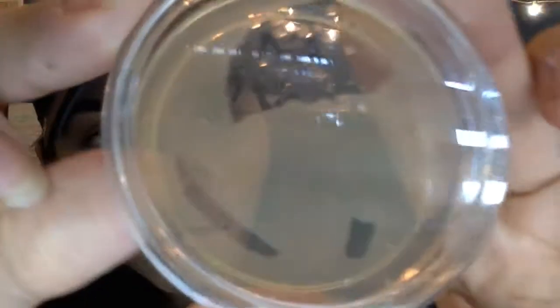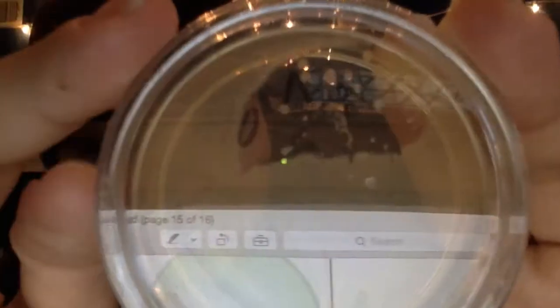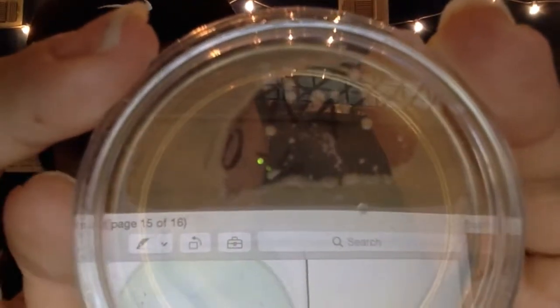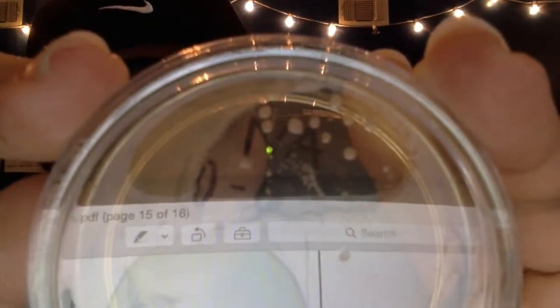And then finally we come to 10^-6 here. Again, we get that thick film covering the majority of the agar plate, but definitely fewer colonies up here that are definitely considered countable, not too numerous to count. So this should be the most diluted plate. So again, I'm glad I waited a little bit longer in order to be able to see the differences in the colonies in the 6 diluted agar plates. So that's the end of the lab.